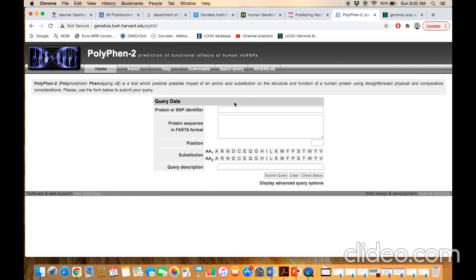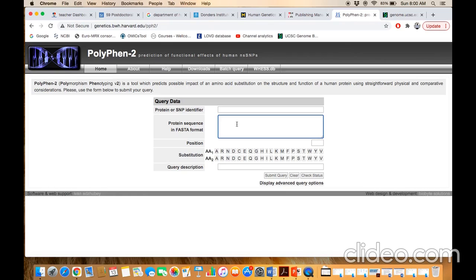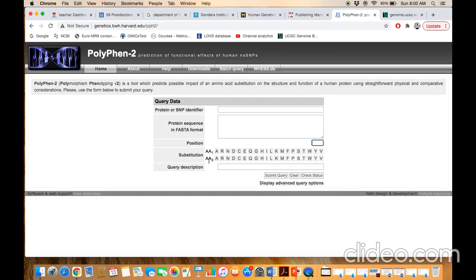This is the home page of PolyPhen-2. You only need to set a few parameters. If you are using the primary sequence of the amino acid, then you don't need to write any UniProtKB accession ID. If you are using the UniProt accession ID, you can write it here and then you don't need to paste the amino acid sequence. In this box you need to paste the amino acid sequence in FASTA format. Here you need to define the position at which the change is occurring. A1 means the amino acid in wild type condition before mutation, using the single letter code. A2 means the amino acid after change.